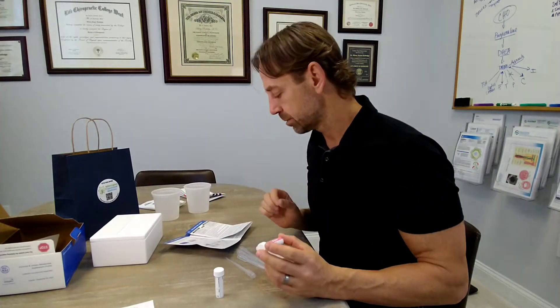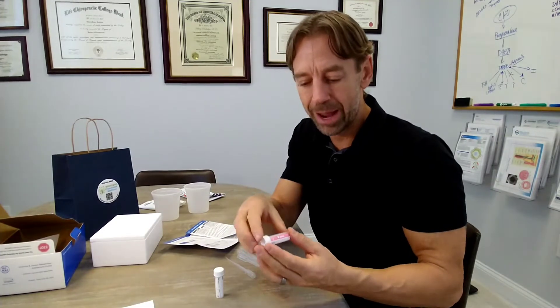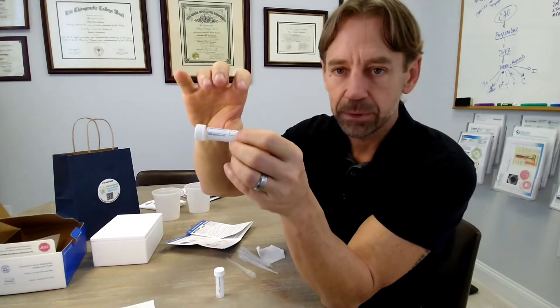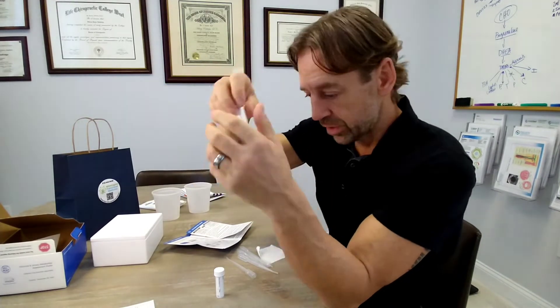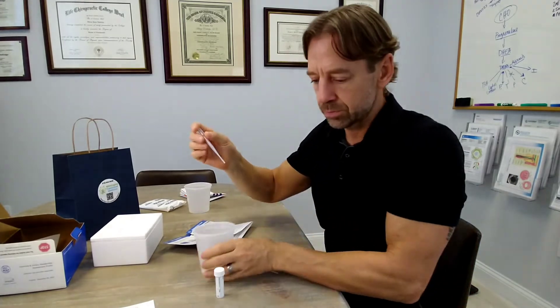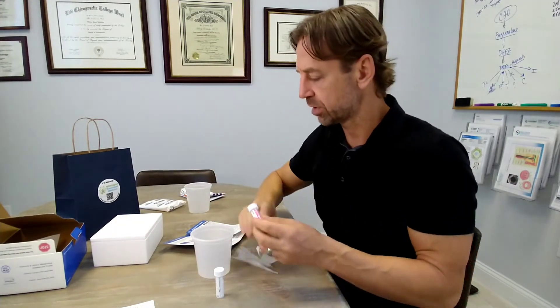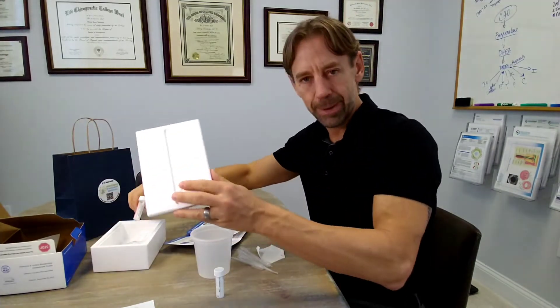The fourth sample is the pink tube, collected within 10 minutes of waking up. Go to the bathroom right away. Write your name, date of birth, time, and date on the tube. Pee in the cup, pipette the urine into the pink tube up to the fill line, and close it off. Put it into the bag and back into the box.